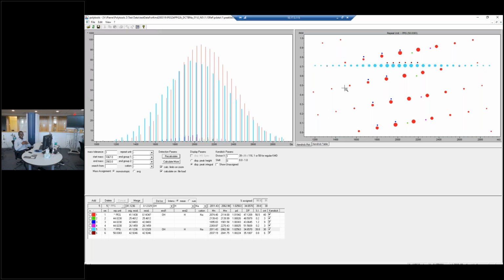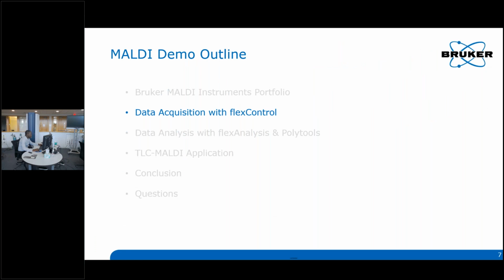They're integrated together, so you don't have to load the data from your local folder and open up a different software to be able to look at it. It basically loads up into the different softwares as you're analyzing and as you go, and you can come back and change it if needed. So now moving back onto our PowerPoint presentation for a few more things that I would like to show you.